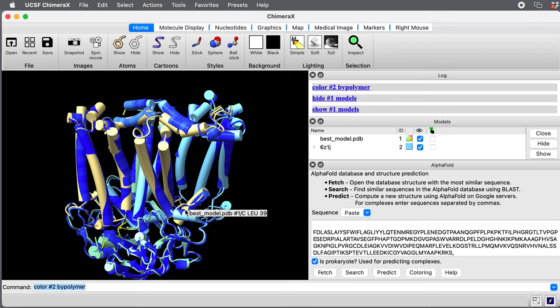In the AlphaFold Multimer paper, AlphaFold Multimer is the name of this version of AlphaFold that predicts complexes. They said about two-thirds of the interfaces were predicted correctly in a benchmark of about 4,000 PDB models.